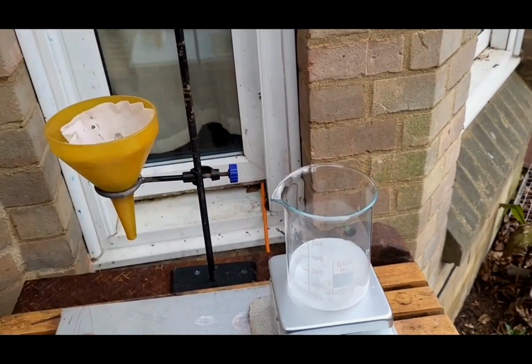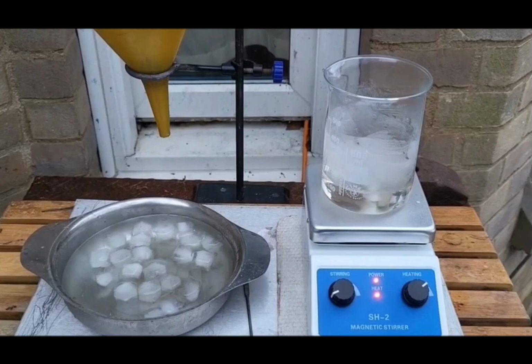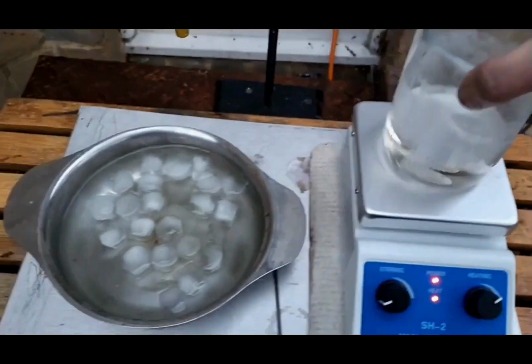We first dissolve this in our mildly acidic solution, then reprecipitate it using an ice bath. This removes soluble impurities, giving us a purer product to start with.